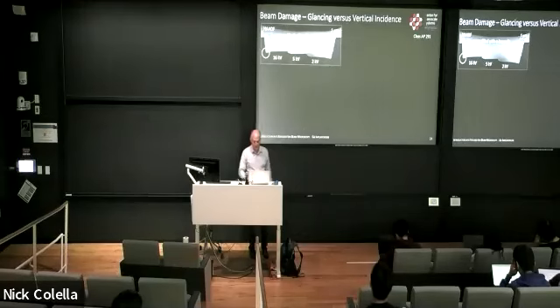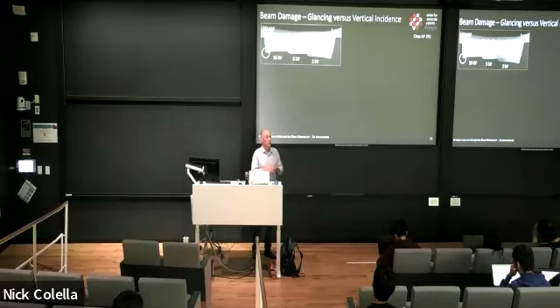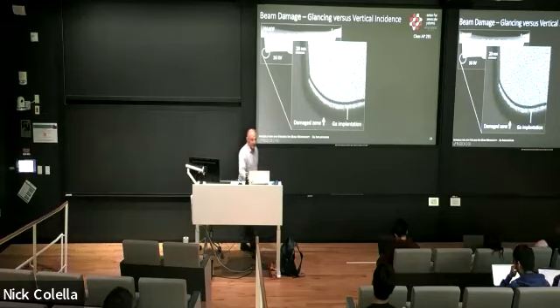And this is illustrated here with this experiment where I just cut a little trench into a sample. So you see here a little trough, and then I prepared the TEM sample of it. And then you can see here in detail, near the corner, the actual structure. So the mottled structure on the top right is infiltrated material that I produced with the gas injection system. And then this dark band that goes around the corner, that is the defect zone.